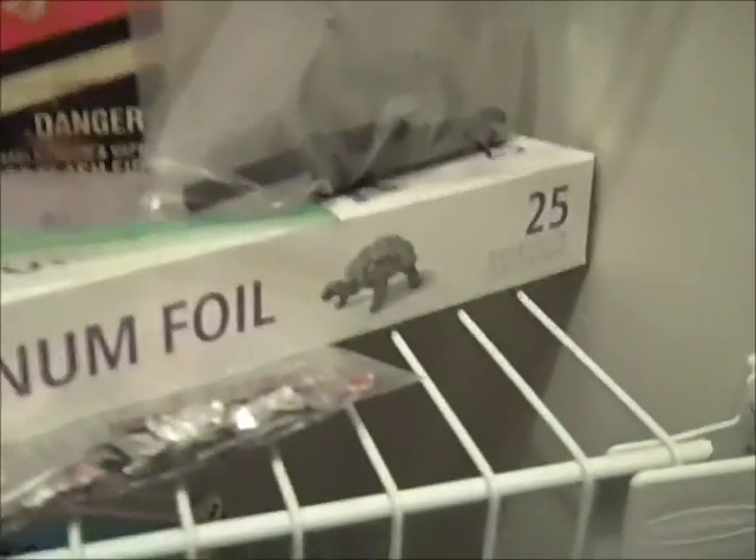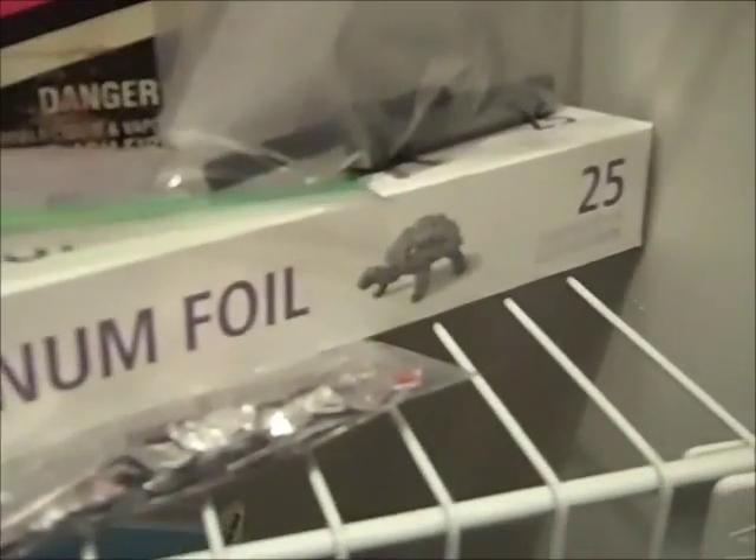The next bag is of carbon in the graphite form. I got these from a lantern battery that I took apart and extracted the electrodes from. There are four electrodes, each of which contains one carbon thing.